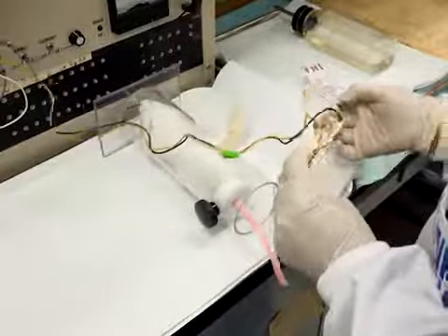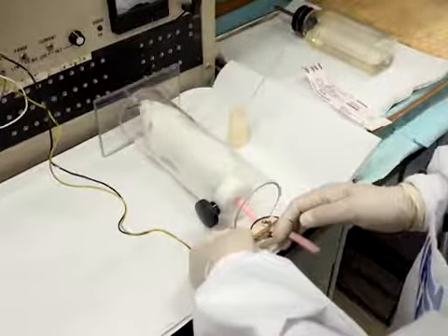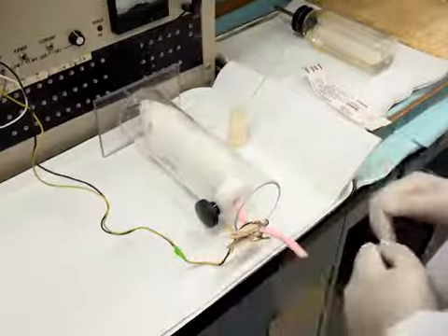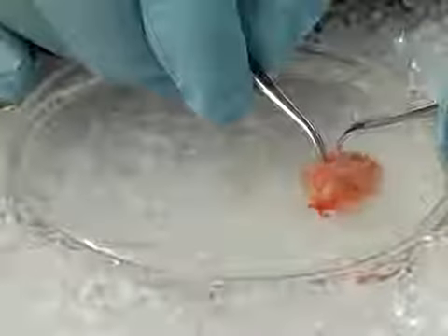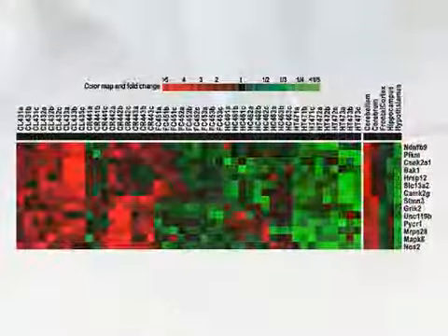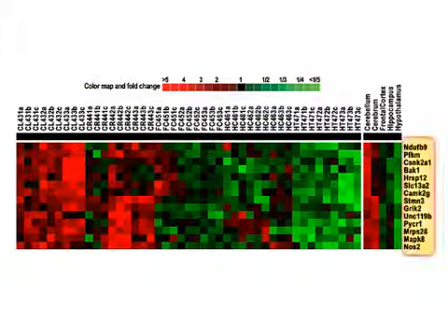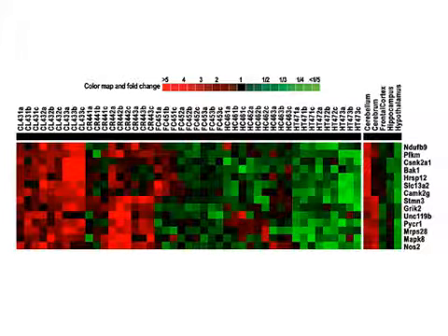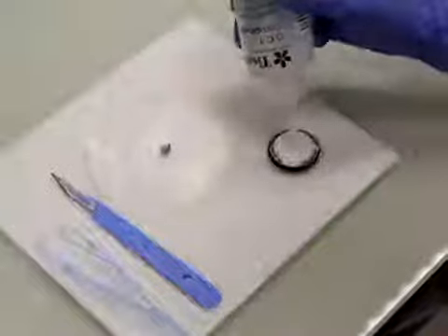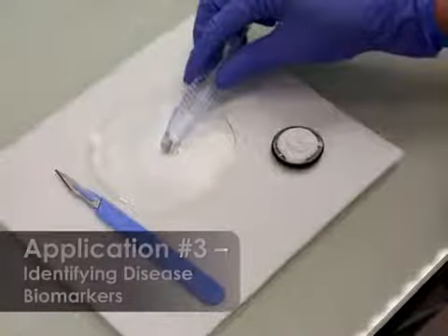Microarrays can also be used to assess expression differences between different cells or tissue types. In this experiment, a rodent model of post-traumatic stress disorder, or PTSD, was established by exposing rats to electric shocks. Neurons were collected from different brain regions and RNA was isolated. Microarrays were then used to identify differential expression of mitochondria-associated genes in these neurons, providing insight into the complex molecular mechanisms behind PTSD.